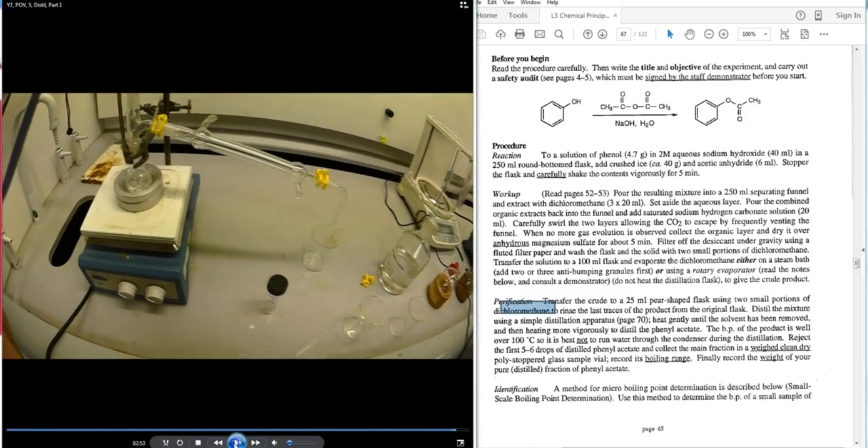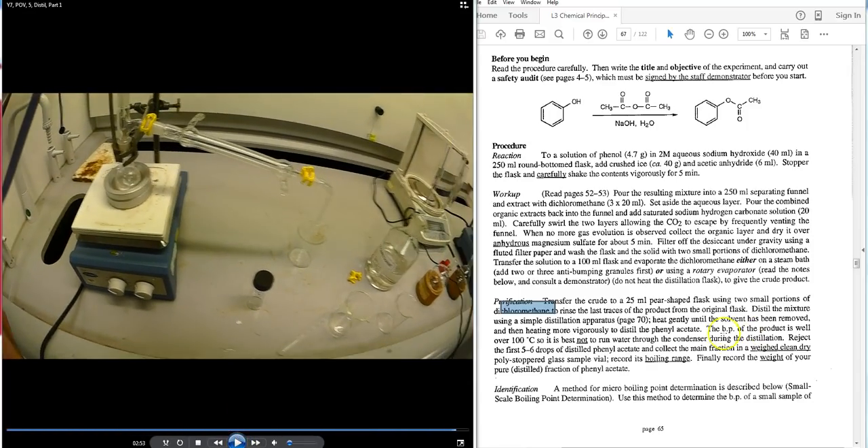The student is heating and collecting the first drops of DCM into a beaker, which is then discarded. Place a pre-weighed non-waste receptacle — vials or beakers of known weight — under the receiver to collect the phenyl acetate fraction. The thermometer bulb at the still head joint records the observed boiling point, and this is how the product is purified.